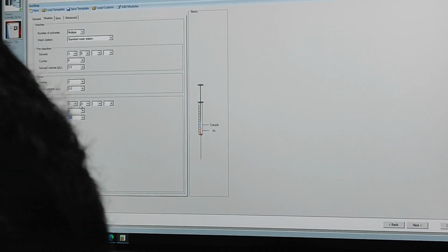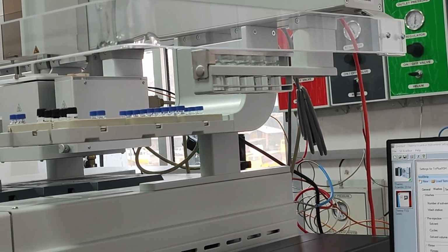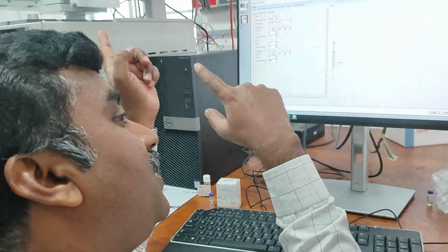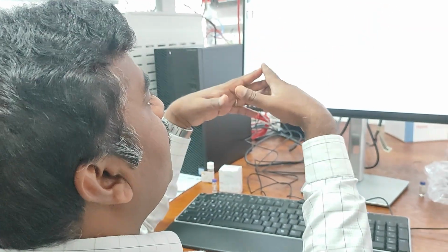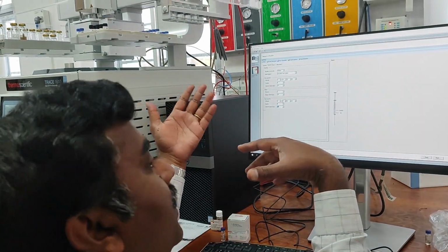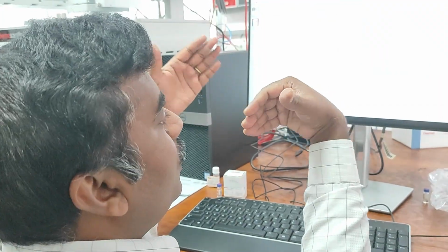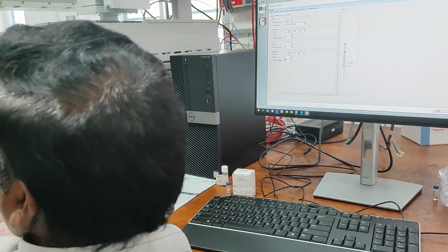See here, A, B we have taken. Why? Because if pre-wash and post-wash use the same solvent or same vial, the contamination level is higher in post-wash, and the same contamination will go to the pre-wash also. Pre-wash should be completely free from contamination. So that is the reason we suggest always going with different vials, either A or A, B. Whatever you do, dedicate vials for pre-wash and post-wash separately. Then there will not be cross-contamination. Clear?